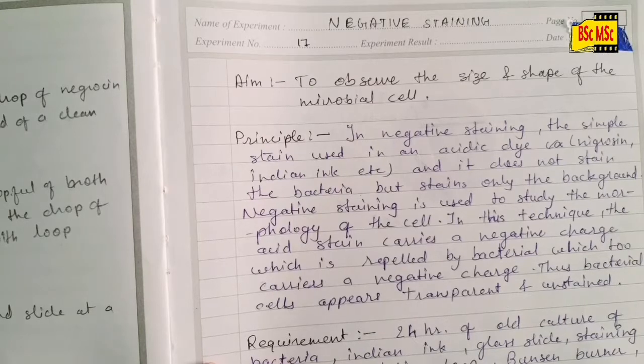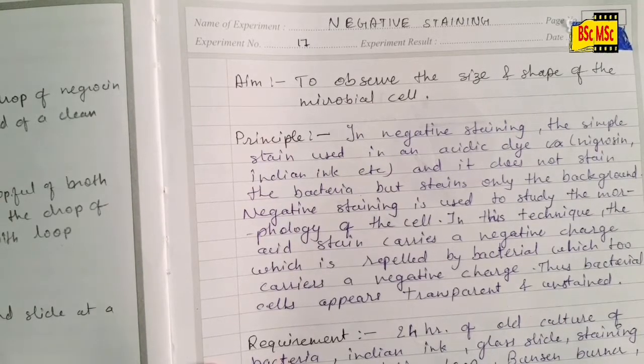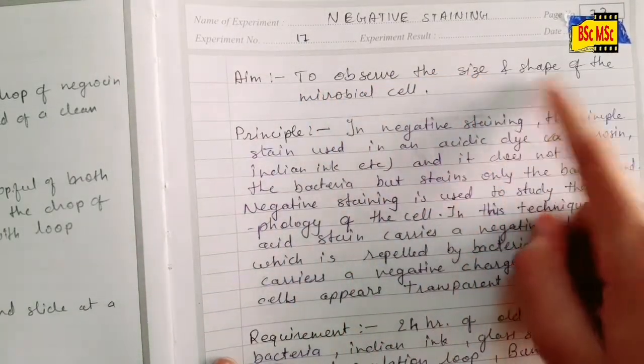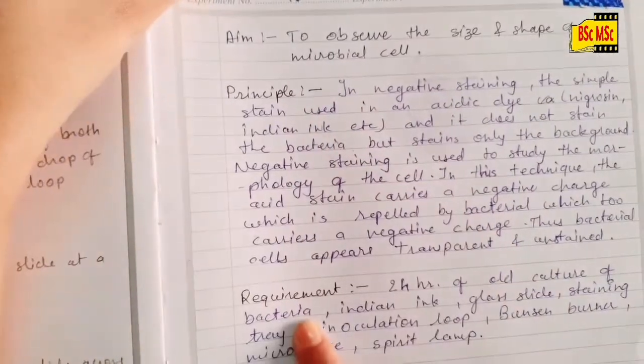Hello, today's topic is negative staining. To write this experiment in your practical record, first you need to write the aim: to observe the size and shape of the microbial cell, then principle, requirement, procedure, observation, and result.